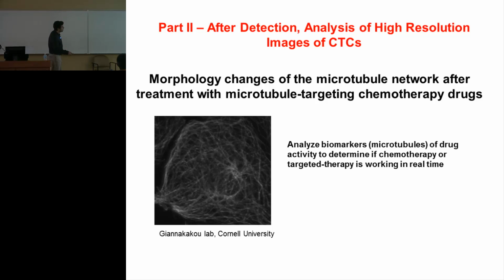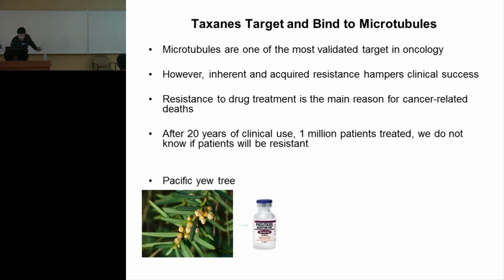so high resolution imaging of the microtubule network, where we can evaluate changes in this network after treatment with drugs. So basically we use the microtubules as a biomarker of treatment efficacy in real time.